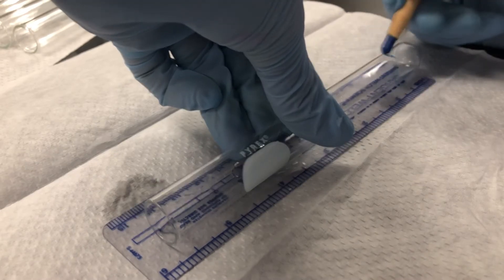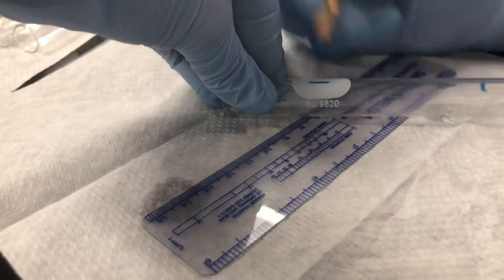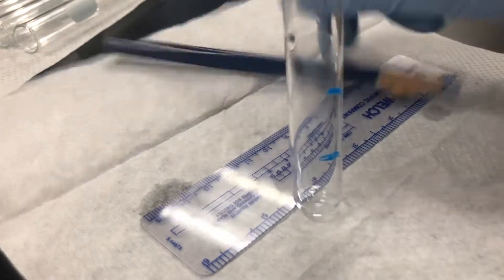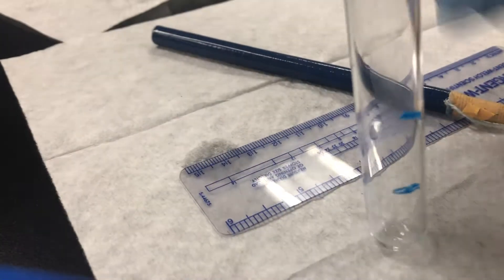Look on the metric side and mark it at two centimeters, then mark it at four centimeters. Number or label however you've been told, and that's your test tube setup. So if you need a test tube with two centimeters and four centimeters marked, there you have it. If you need one with just two centimeters marked, obviously you just mark it at the two centimeter point.